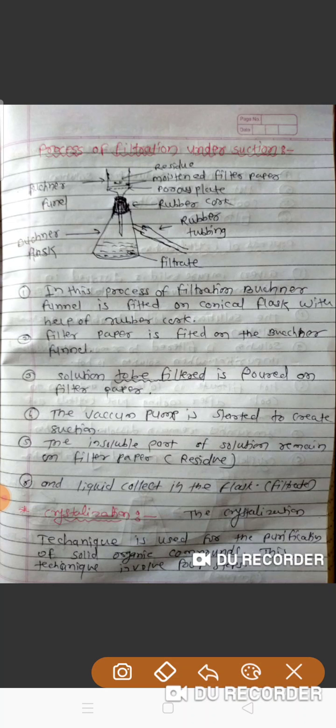The insoluble part of the solution remains on the filter paper, that is called the residue. The filtrate goes into the Buckner flask, and the liquid collected in the Buckner flask is called the filtrate. Do you understand? This is the process of filtration under suction.